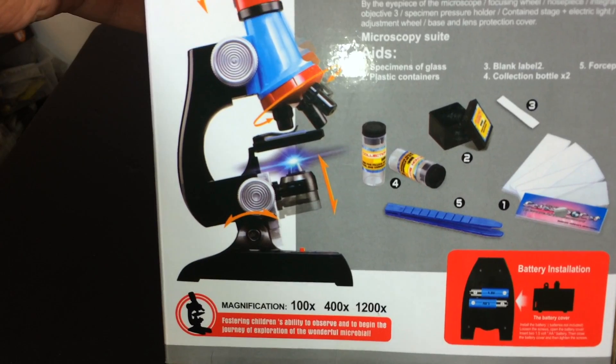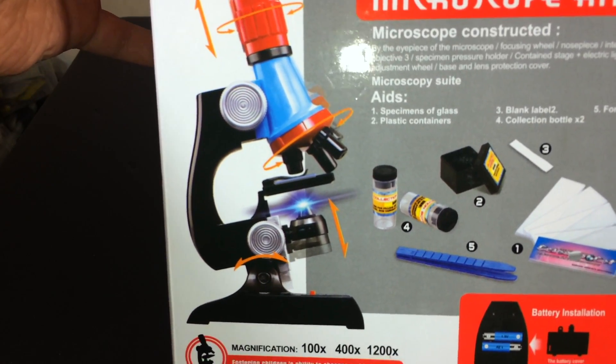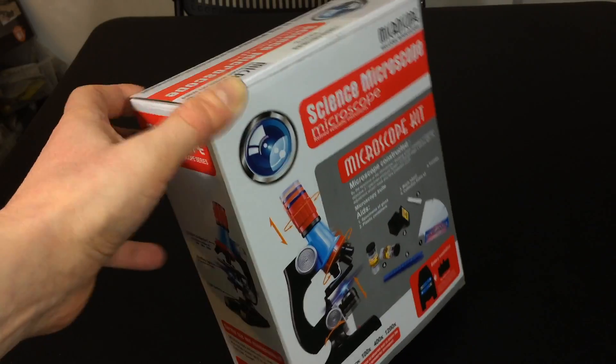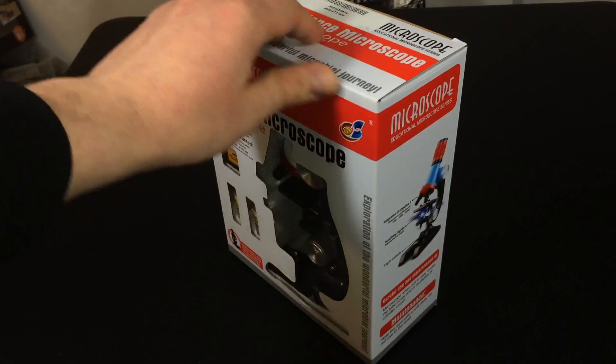And it is also battery operated and you do have a light upstage. As you could tell, there's a single LED right here. And basically that will enable us to see right through the slides. So let's open it up, see what we get, and give it a run.